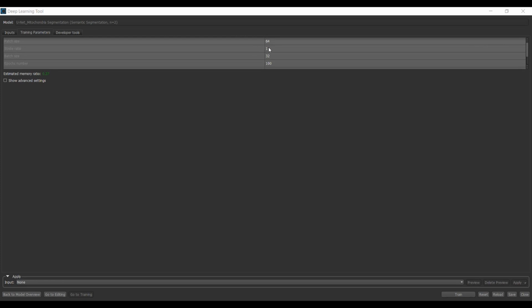Okay, so if you set the value as 0.5, there will be a 50% overlap. And if you keep the value greater than 1, there is a gap between the first patch and the second patch, between data patches. Okay, so that's called stride ratio.